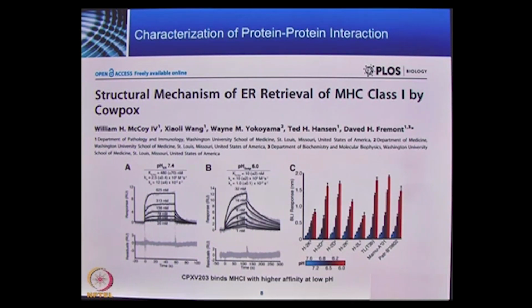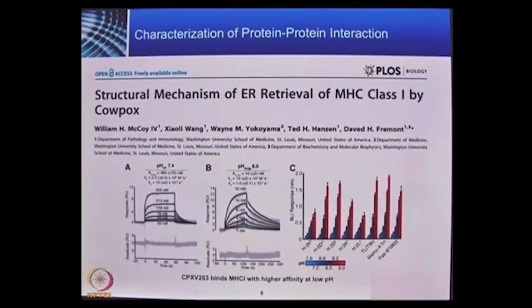And in another experiment, they then performed the analysis using the BLI technology. And the data shown here supports that the kinetic constants achieved with the BLI technology are the same as the ones achieved with SPR technology.